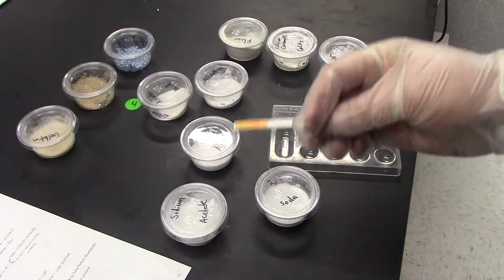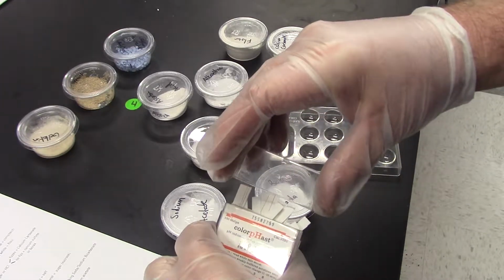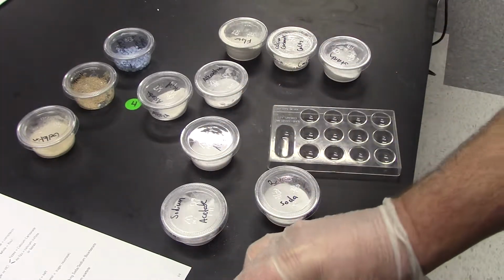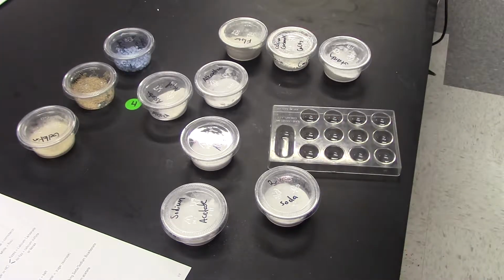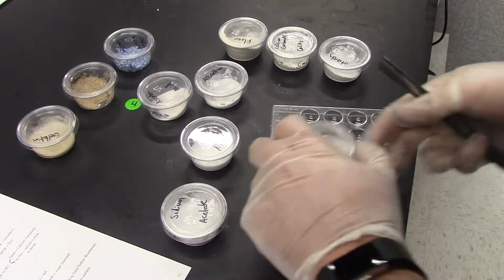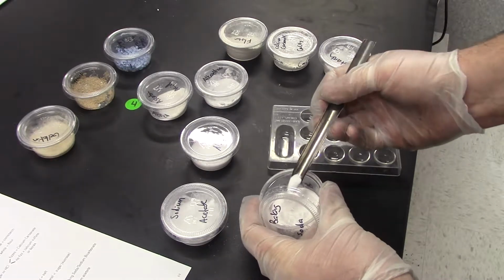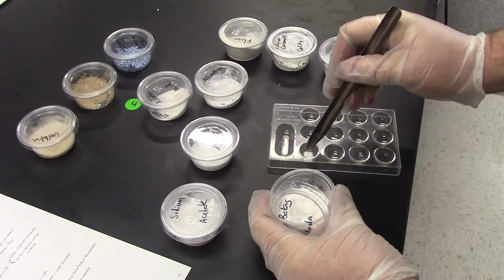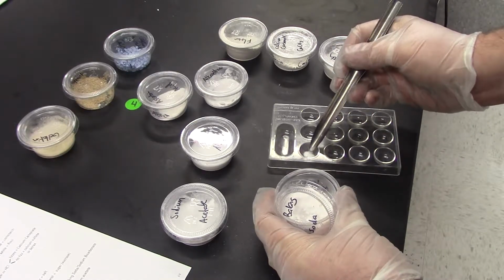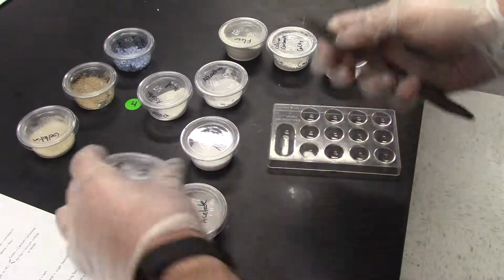You'll put this into water, so the baking soda, for example, and just for the sake of seeing how this would actually work, I'm going to go ahead and put just a little bit of baking soda in here. So we add, and this thing's called a scoopula. It's a little metal scoop. You don't need much. You are just seeing if reactions are taking place. And then to this, we're going to need to add water.